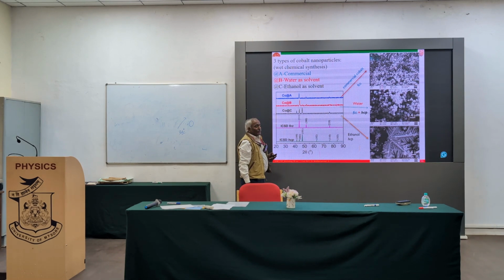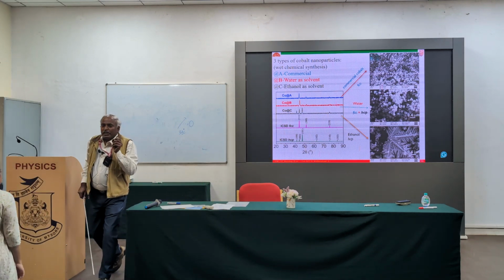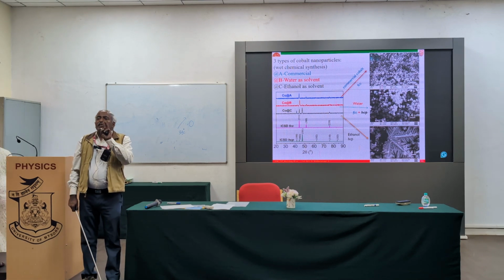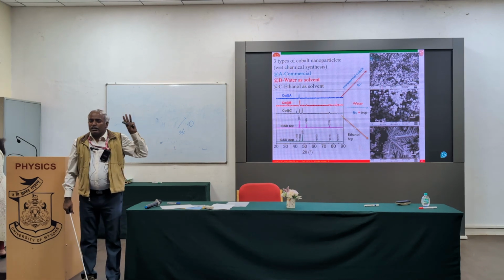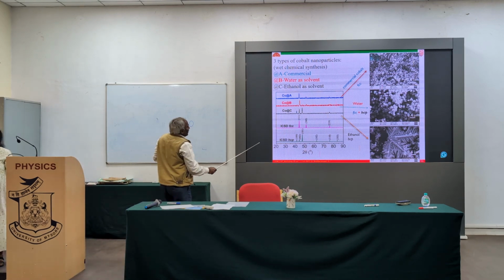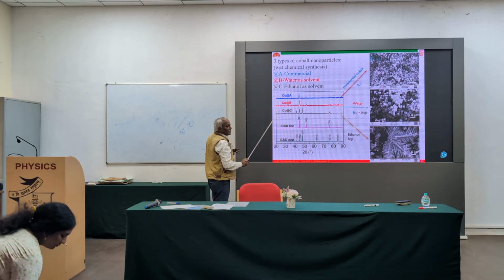But the problem here is, as Mani said in the morning hours, that for FCC and HCP, whenever we do XRD, there are 3 peaks common for both phases. Whatever peaks we see here, all the peaks are the same for both FCC as well as HCP.